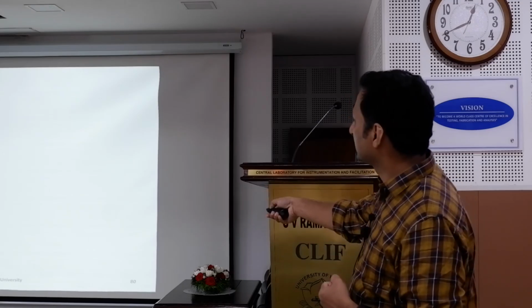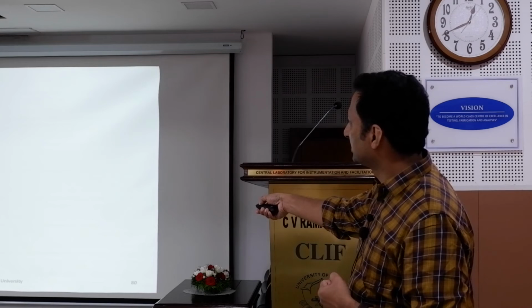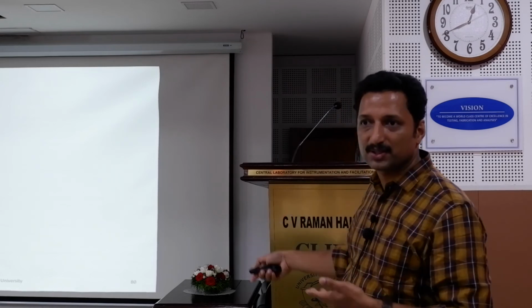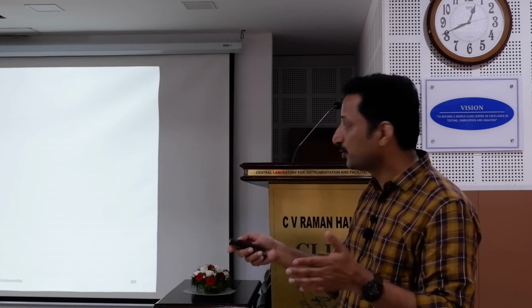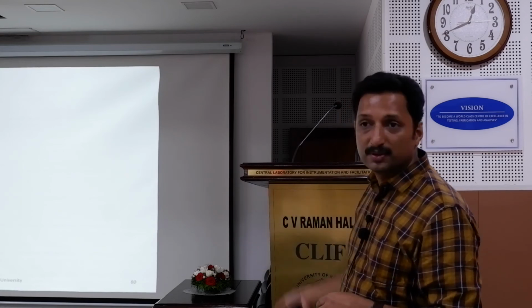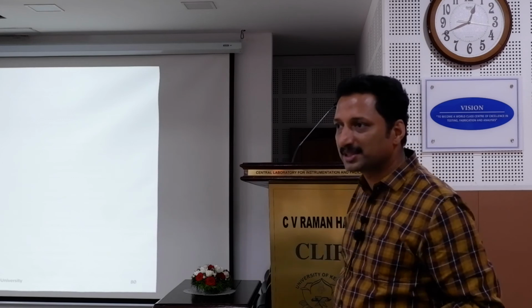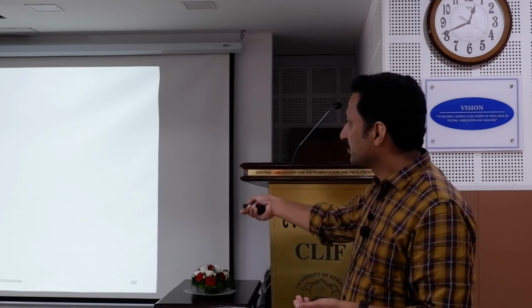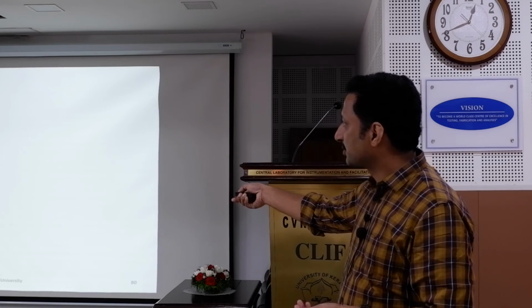So if you look at that, you see the grain boundaries are brighter, which means that the conductivity is larger there. Okay, so you can actually see how big the grains are and how well they are conducting, because this is a solar cell material, so it has to conduct. And where is the maximum current coming from? We know that it is from the grain boundaries here.